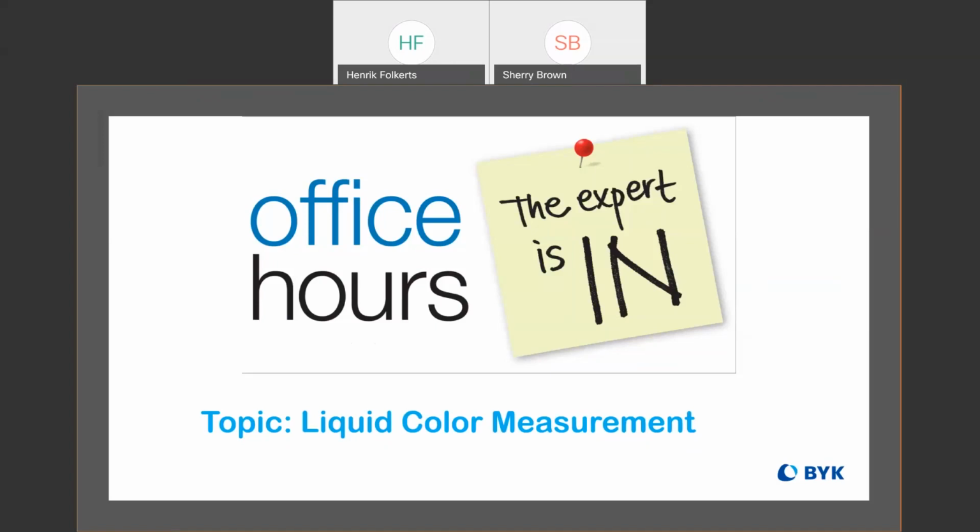So yeah, the question that comes up is how opaque is too opaque for this instrument? I wish I had a definitive answer on when it can be used and when it can't. I don't, but again, that's a case when I would encourage you to send me some samples, and I can take some comparative measurements and see if the instrument will suit your needs.